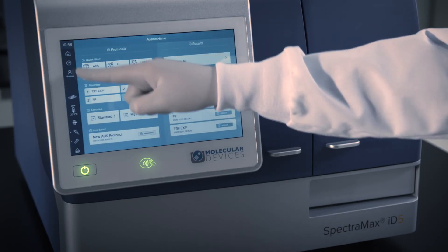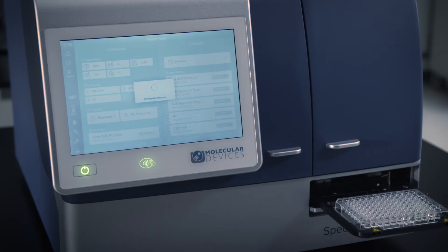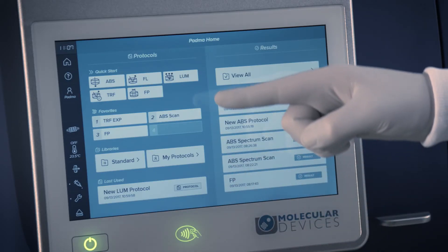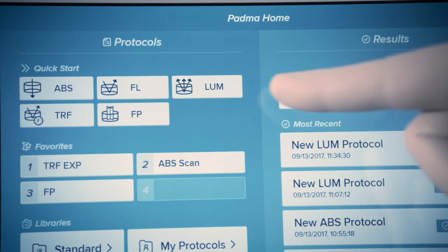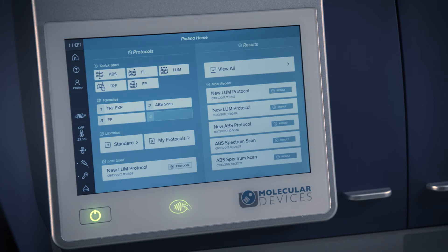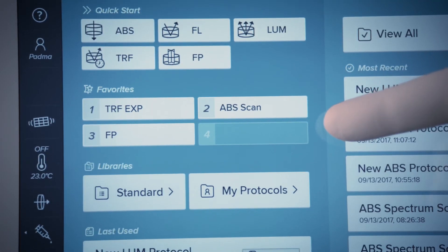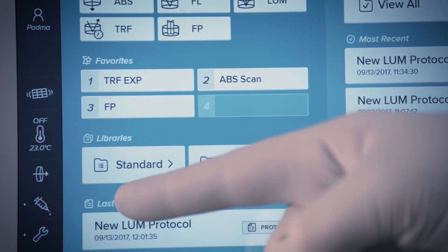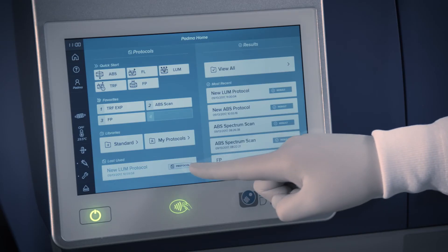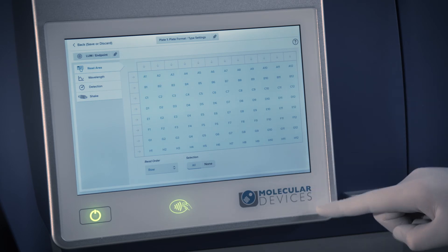Back on the home page, you can open and close the plate drawer of your reader. The side menu functions are accessible on all the main pages. Protocols are displayed on the left side of the screen. Select a quick start if you're on the go or quickly checking parameters during an assay optimization. Other options include starting a read from one of your favorite protocols, a pre-configured protocol in the standard protocol library, your personalized protocol library, or a repeat of your last used protocol. With any protocol selection, you can modify assay settings and create new protocols.